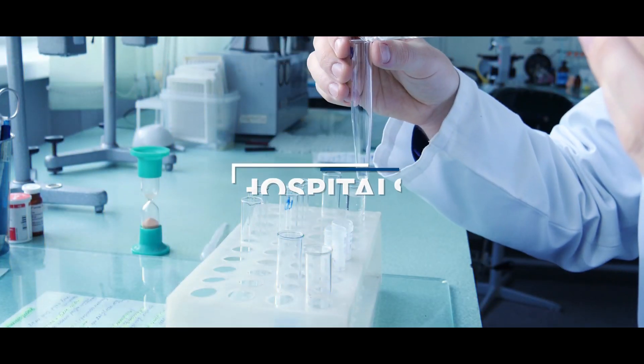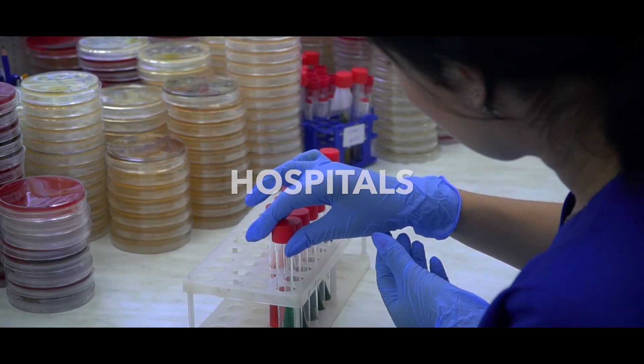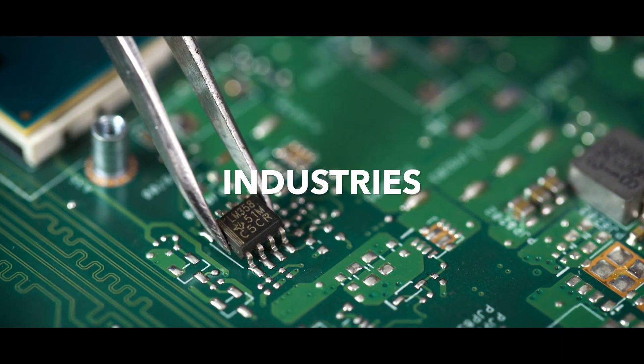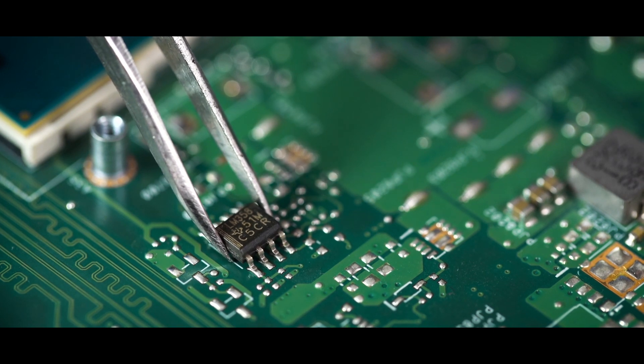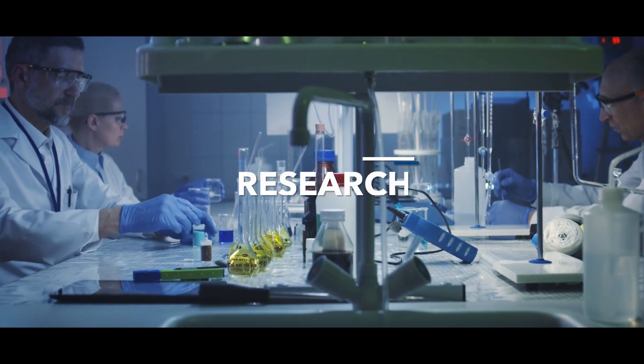In hospitals, it is commonly found in laboratories and pharmacies for compounding of non-hazardous drugs. In industries, it is used for electronic inspection and assembly. It is also used in laboratories with quality assurance departments and in biotechnological research.